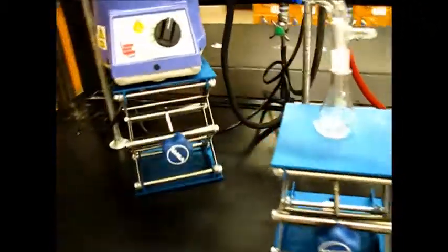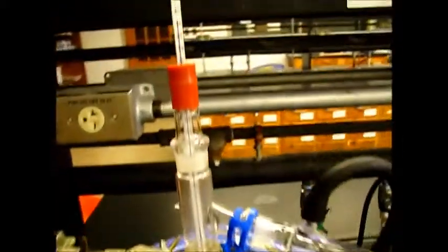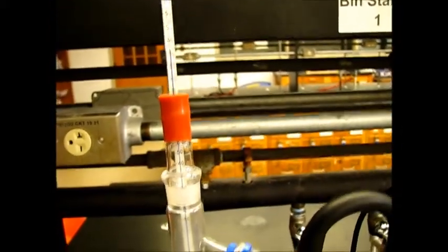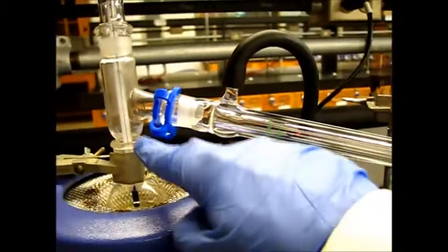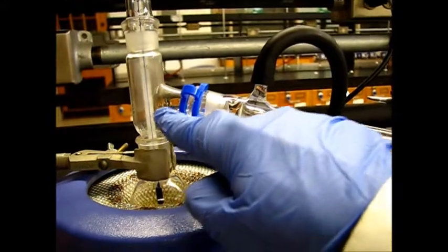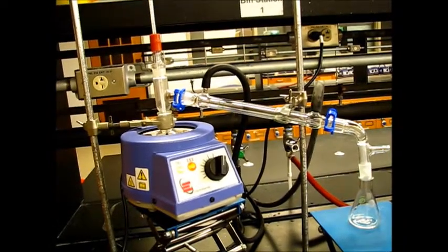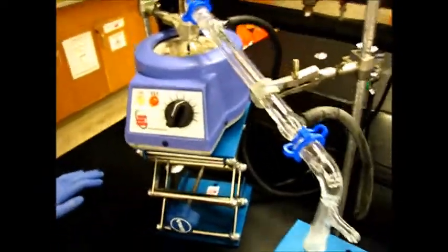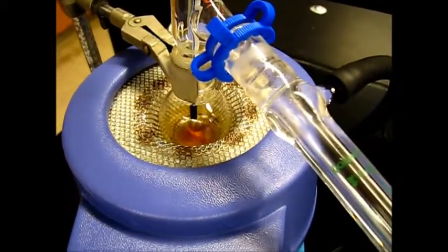And meanwhile, we can see our distillation temperature is right now 135, and vapors are coming over here right now. You can see very soon we will get the product. So here, how much do we have left? So everything is gone.